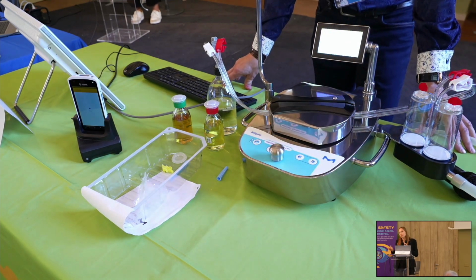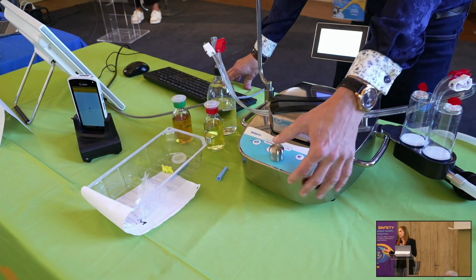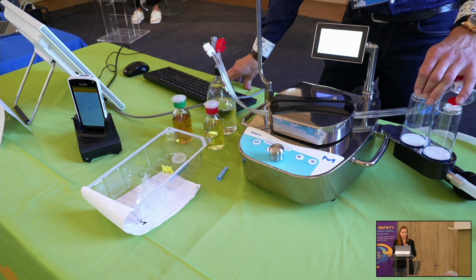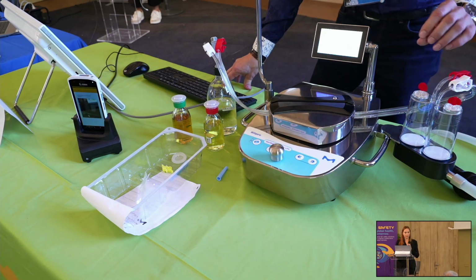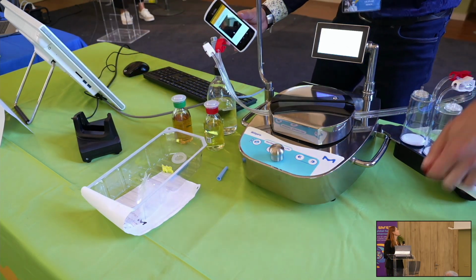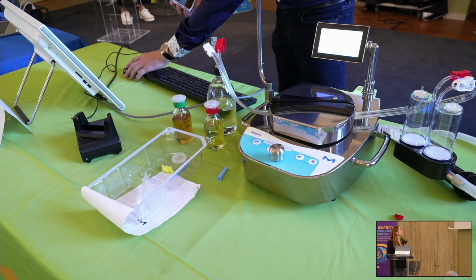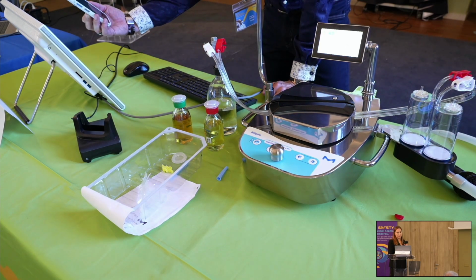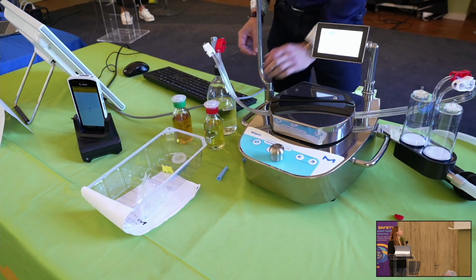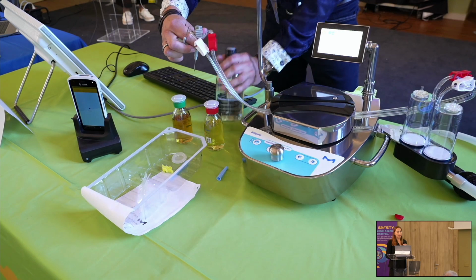And this is really important because in case of overpressure, microorganisms can be harmed, and this could lead to a false negative result. Okay, so we finished this step, finishing all the filtration with the sterility test.